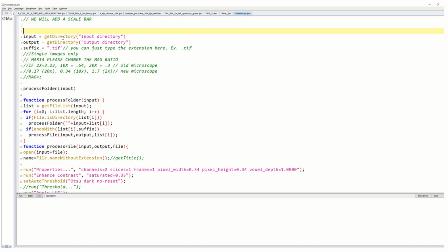I had all of you guys label your 2x folder just 2x, and make sure you label everything exactly how I say, so that as we go forward with our lectures, you're not confused and you're not trying to think about what did I label that? Because we had issues with that today in class. So your 2x folder, you're gonna click on that, and that's the folder that's gonna take all your pictures from. Your output directory, that's gonna be where you're either gonna create a new folder.